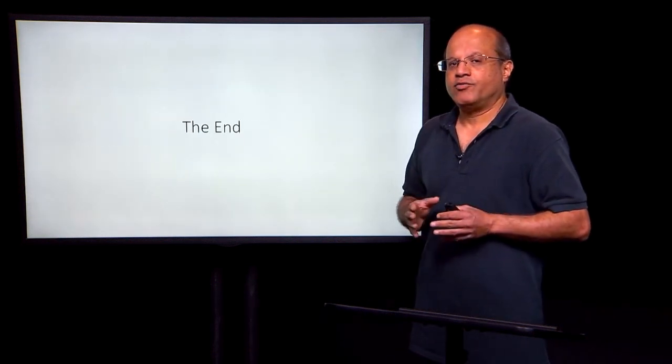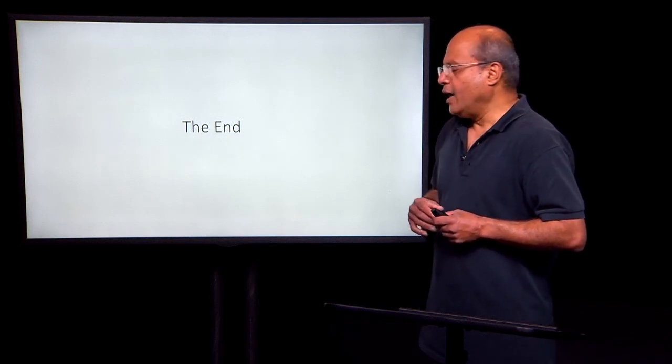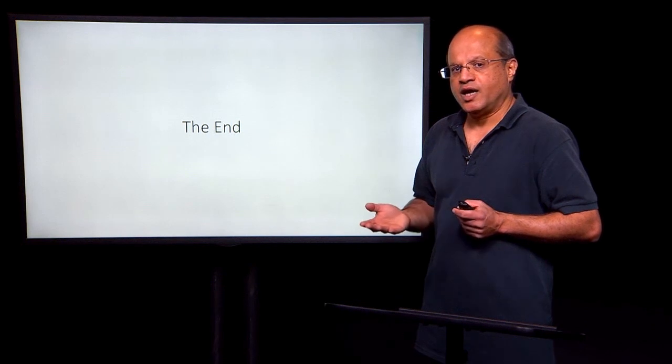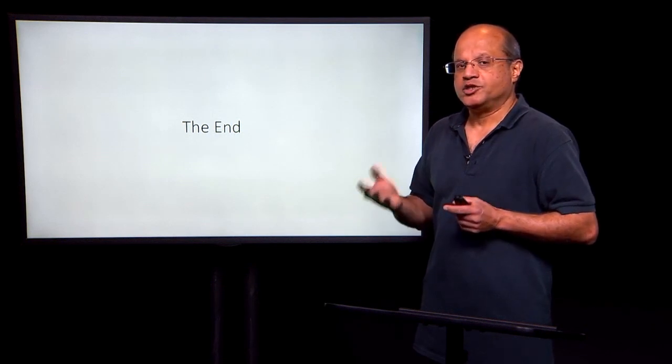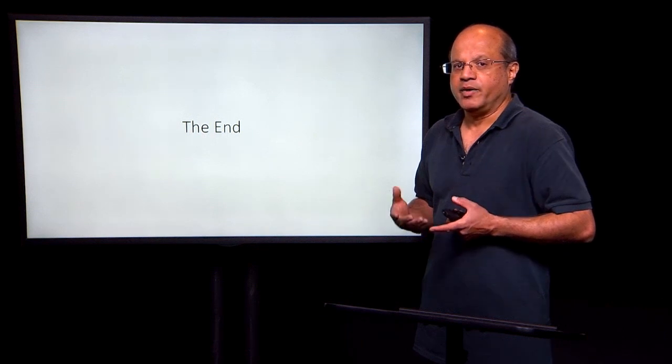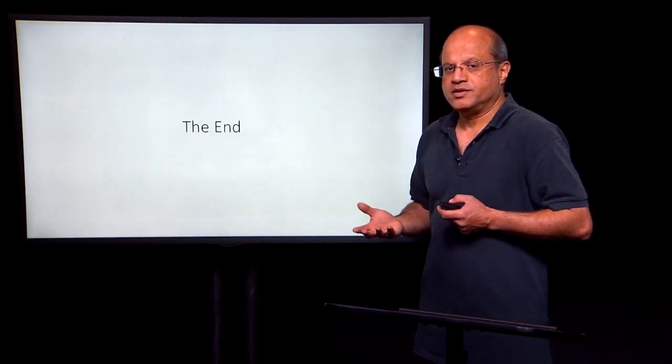Okay, that's all I have for this lecture. Now that we have all of the stuff in place to actually describe the formation of an image starting from a particle, we can then work our way towards actually developing algorithms for particle reconstruction. Okay. Thank you.